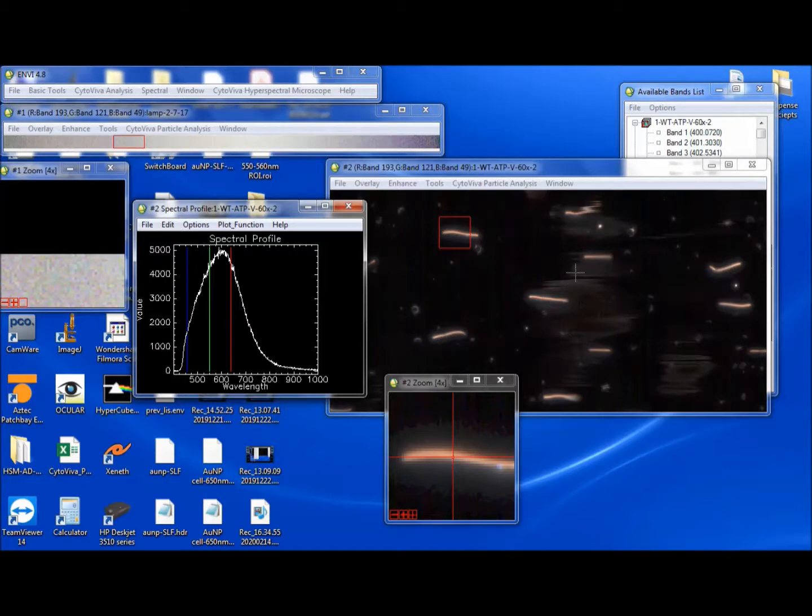So a lot of times it's necessary to use this when you want the true spectrum of something if you're doing some kind of characterization. Or perhaps you have a particle or some material that doesn't really have a super unique spectrum. It's got a spectrum that's similar to the lamp in some cases. That can happen. So this will tease out those minute differences even more by doing this routine.